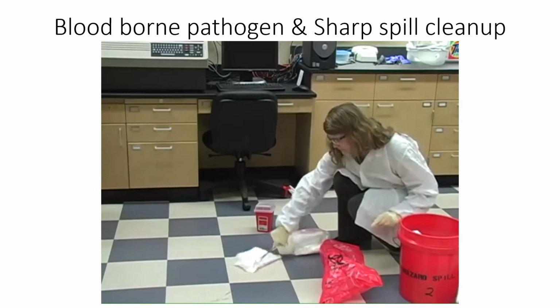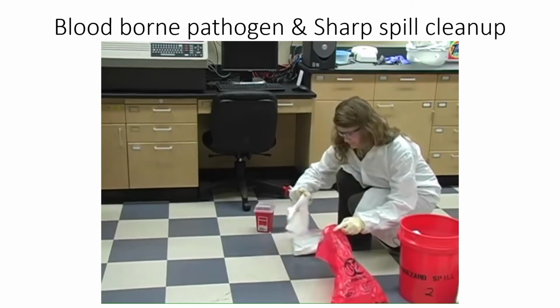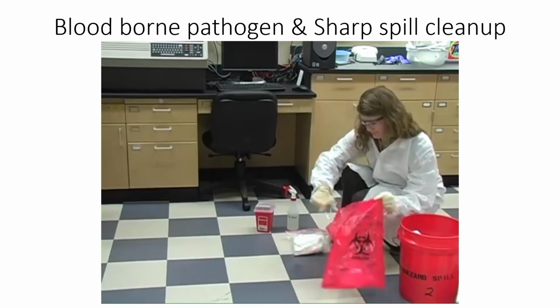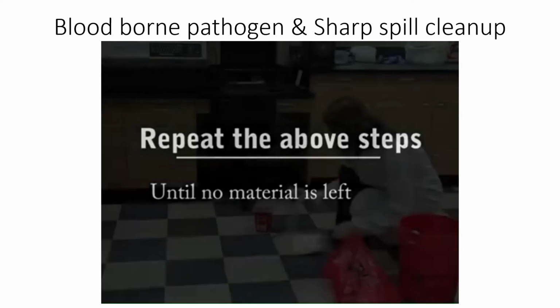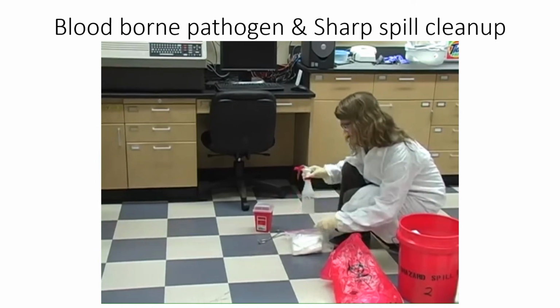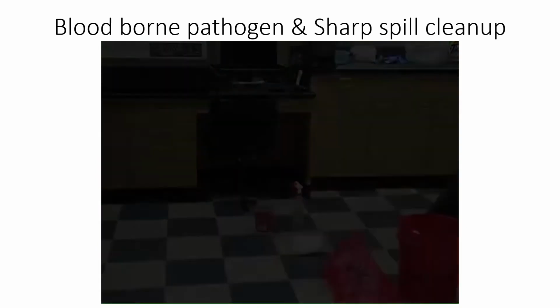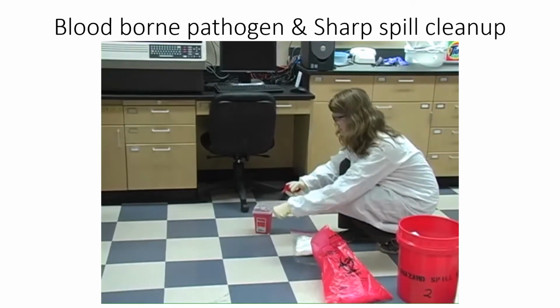If sharps are present, use something other than your hands. Smaller pieces may still be present even after larger pieces have been cleaned up. Repeat the above steps until no more material is left. Disinfect the spill area again and allow time for the disinfectant to work before wiping with paper towels one more time. The next step is to dispose of the waste.